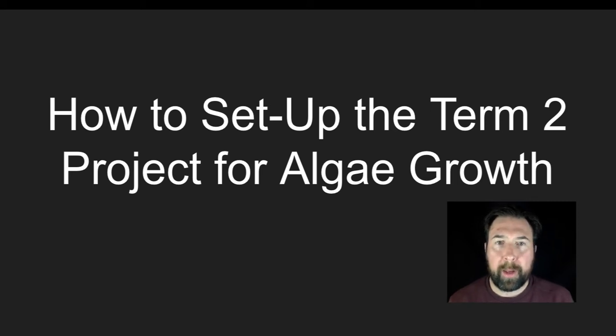Hey everybody, it's Mr. Matthew here to talk about how to set up the Term 2 project for algae growth. So in this video, I want to sit down and talk about the materials that go into it. I'm also going to talk about the controls that you will use. I'll also talk a little bit about how you go about doing your measurement using the McFarland Standards.